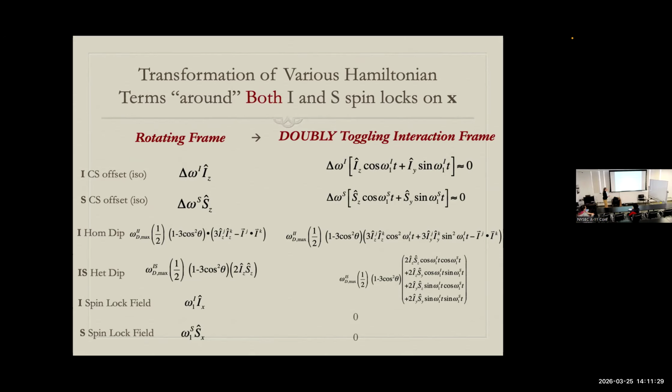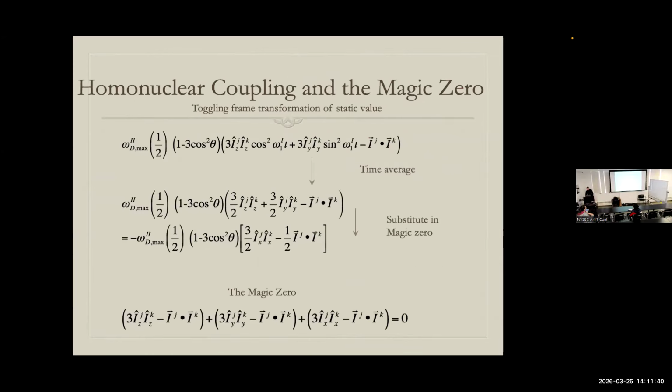So now we want to look at it. This is a frame transformation where we have isolated one term as being active and all the rest of them as being obliterated by one way or another. Now, before we treat that term, we're going to transform it with a trick.